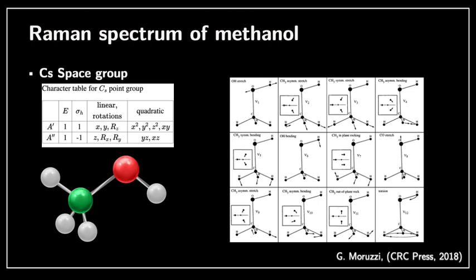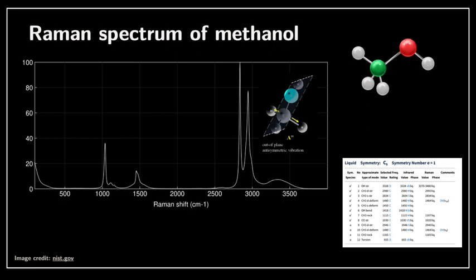So on the right-hand side, I'm showing you all the vibrations of methanol. Again, if you are interested, just pause this screencast and look at them more carefully. I'm not going to go into details, but in principle, we should be able to see all those vibrations and different frequencies in the Raman spectrum. And this is the Raman spectrum of methanol.